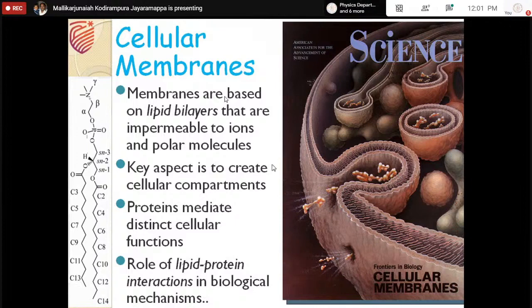The top portion we usually label as the head group, and this lengthy thread-like structure we call the chain. The head group is where more atoms are joined together.